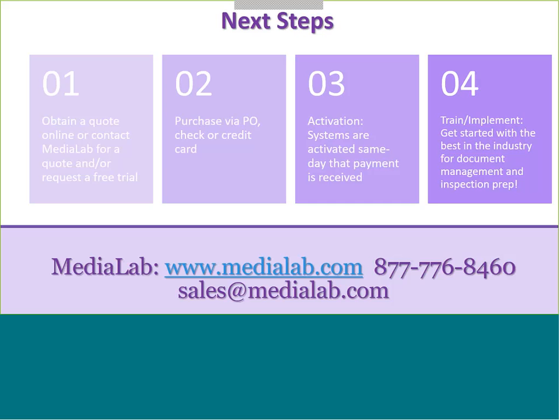And I think that we're pretty much the best in the industry as far as document management and inspection prep, and especially the training that's involved in getting the labs up and running.